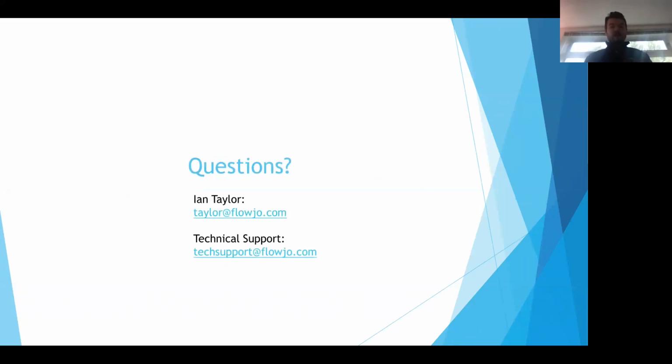And with that, I'm going to leave this help information open while I go through some of these demos, in case you want to take down notes on that. Maybe we'll start with SeqGeq.